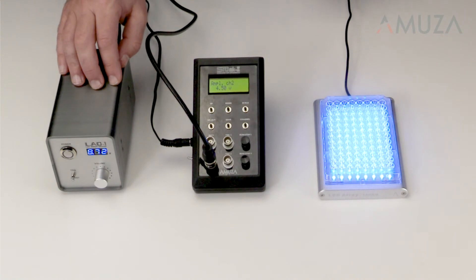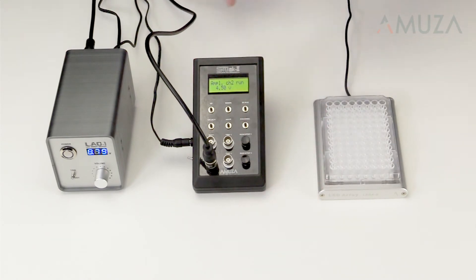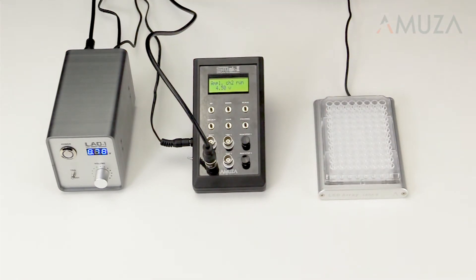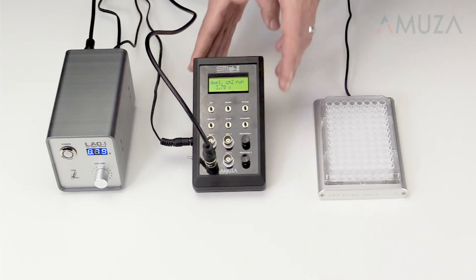With a pulse generator, you can send a train of pulses to the array. Lowering the voltage of the pulse lowers the voltage sent to the LED array proportionately, allowing programmatic control of not just the timing, but also the intensity of illumination.